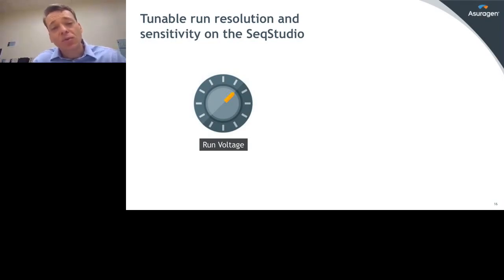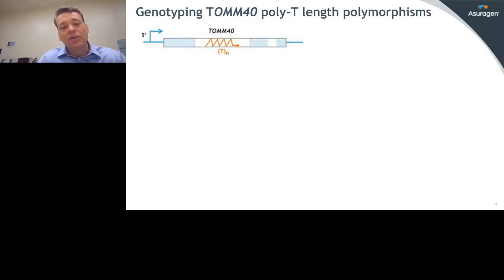So it depends on what you're trying to accomplish with your assay, to be able to favor individual high-resolution sizing out to some very long distance, or whether you want sensitivity beyond a certain threshold. The assay has the capability to be able to do that. And because you can run many different samples on one plate with different run modules, which is exactly what we did here, you have a tremendous amount of flexibility to be able to quickly isolate optimal conditions to suit the assay at hand.